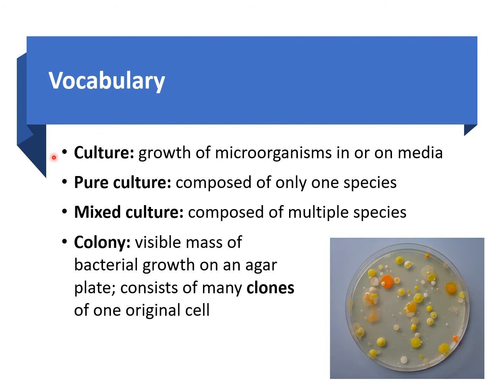The first one is the term culture, which we've used before, but just to refresh your memory, a culture is basically growth of microorganisms. So anytime we talk about growing bacteria, instead of using the term grow, we use the term culture. When I say I'm going to culture my bacteria, it means I'm going to grow my bacteria. You can use it as a verb, or you can use it as a noun.